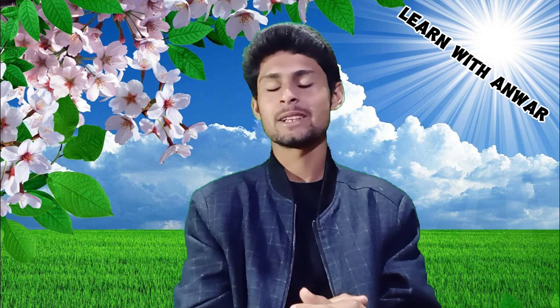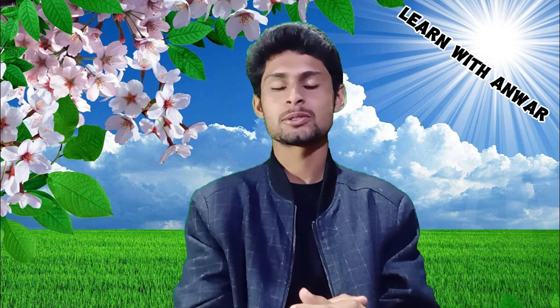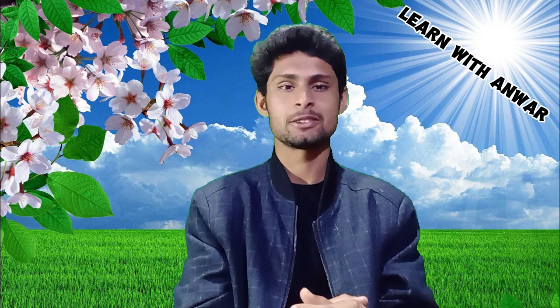What is a microscope? What is its function? What are the parts of a microscope? And what is the history of the microscope?